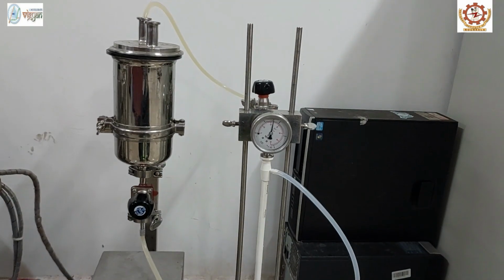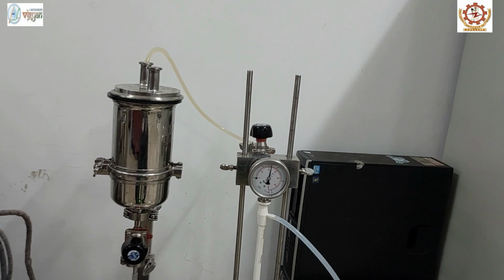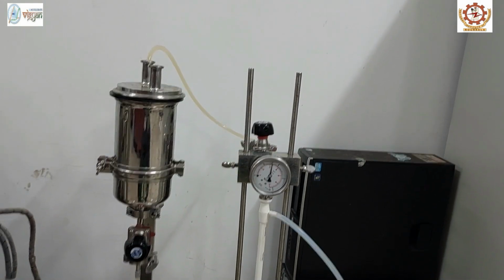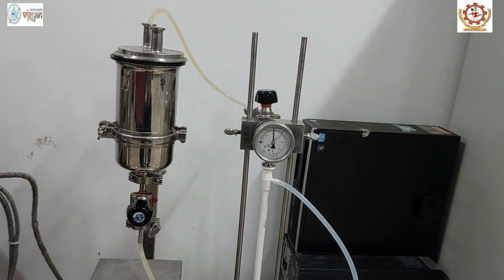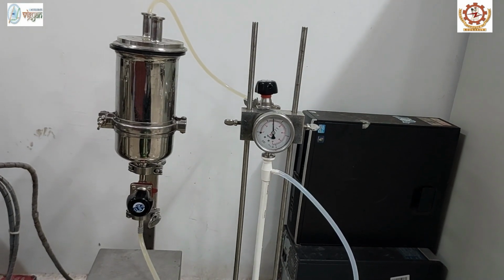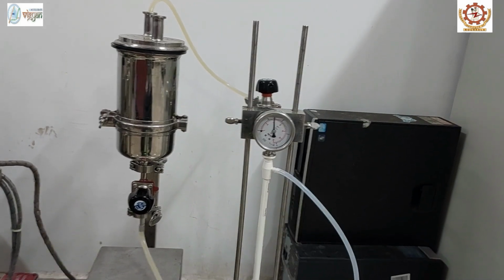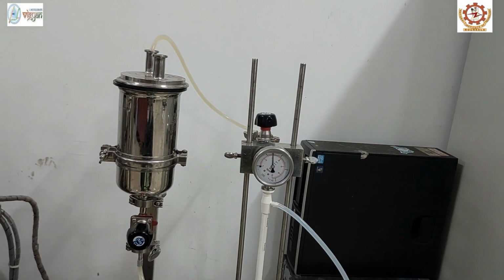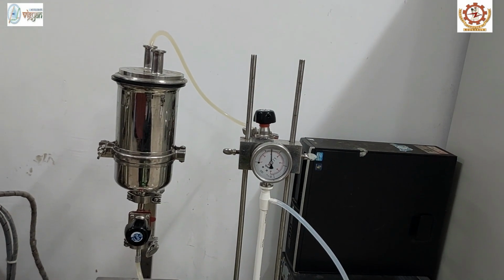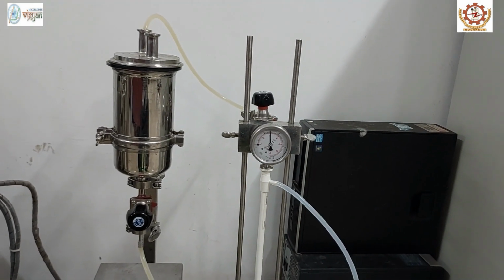Initially, the membrane will be rinsed using tap water at minimum transmembrane pressure and a maximum flow rate for 30 minutes. Subsequently, 0.1% NaOH solution will be heated to 50 degrees Celsius and flushed through the membrane for 30 minutes at the same transmembrane pressure and flow rate. This is the alkali wash that we follow.